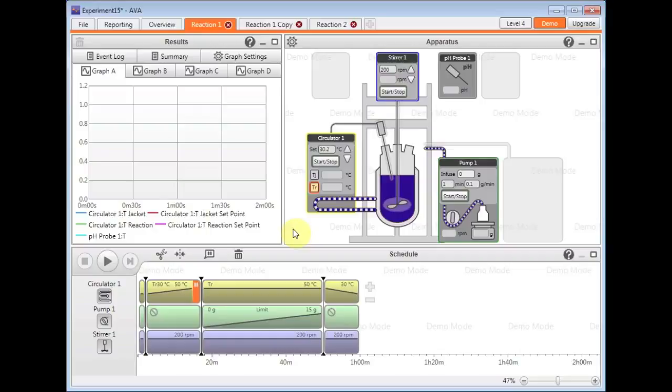So this was just a general introduction to the AVA software and its features. I hope you found it useful. We do have many other video tutorials which explain everything in detail, from setting up your apparatus to your complex schedules with the advanced safety features which I've briefly touched upon. You'll notice that there's lots of different question marks throughout the software. These will take you to the relevant section of the help pages and can hopefully provide you a little bit more information on what you're trying to achieve.